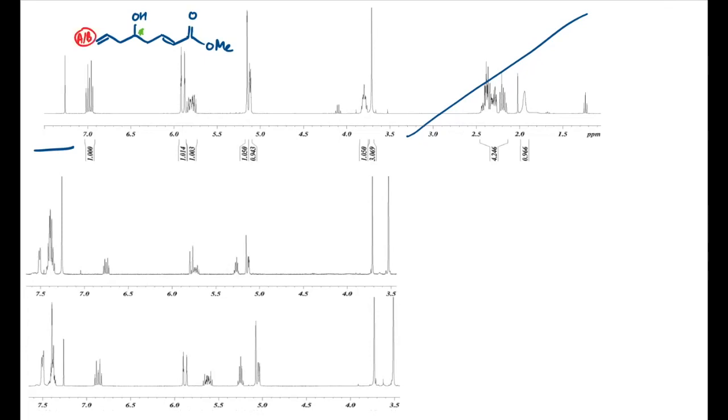So that's A and B, that's our two doublets. That's these overlapping doublets here. Peak C was this doublet of doublets of doublets of doublets, or a multiplet, down the bottom here. And then there's the two protons on the alpha-beta unsaturated ester. Proton I is the one that's really deshielded and it's at the highest chemical shift, and J is the one in the alpha position, which is this nice clear doublet.